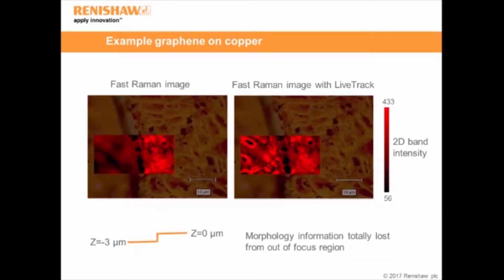Here we have a simple example — graphene grown on copper between two different copper grains, with a grain boundary running down the image. This first image is a simple fast Raman image without LiveTrack, and you can see that because we're out of focus on the left-hand side, we lose Raman intensity. We also lose a lot of spatial information, so we essentially lose all the morphology of the sample. This grain height difference is not very much — it's only 3 microns, a very small amount.